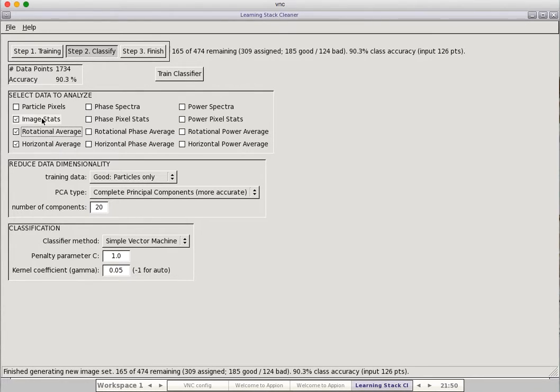Like I said, the more things you have, the more they're updated. You can see the number of data points you have increases the time it takes to do the training and the calculation. If you limit that number, it is a little bit more zippy. So this is the default settings that I've had selected.